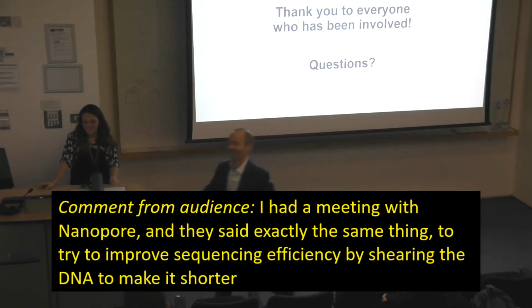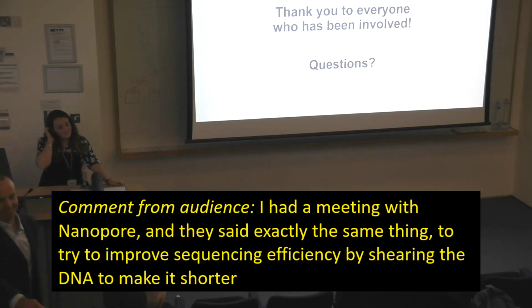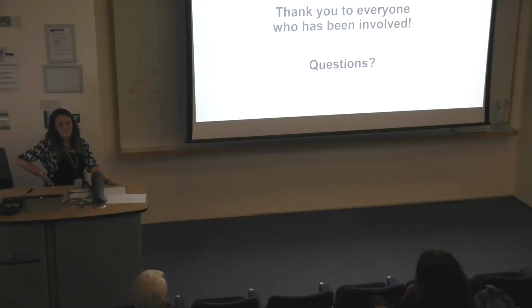Oh yeah, I was just going to say, I was in a meeting with Nanopore the other day. And they said exactly the same thing as you, that when they fragment their reads down, it will actually work at 10 to 20. Is that Justin by any chance? It was. Yeah. I've been working very closely with him. It's been following me through this journey.